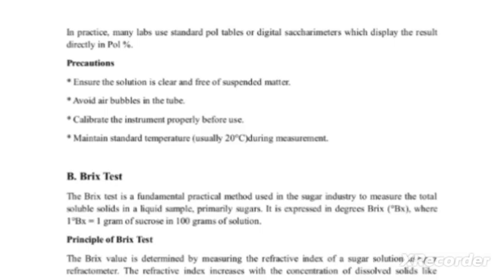Precautions. Ensure the solution is clear and free of suspended matter. Avoid air bubbles in the tube. Calibrate the instrument properly before use. Maintain standard temperature, usually 20 degrees Celsius during measurement.